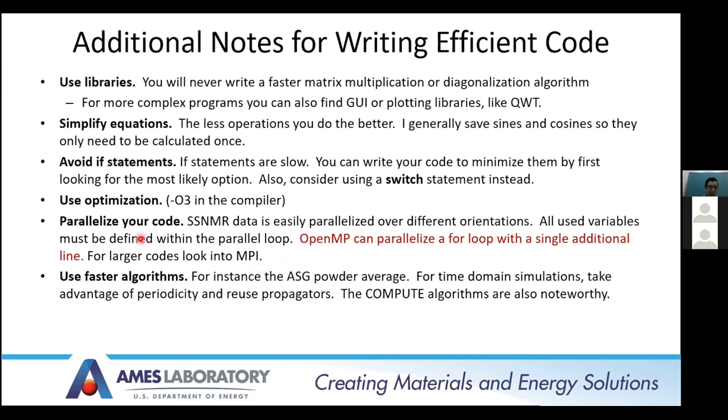And lastly, like someone mentioned, you'll want to use the faster algorithms. So if you're doing calculations in the frequency domain, use the interpolation scheme of Alderman, Solum, and Grant. And if you're doing time domain calculations, you can take advantage of periodicity and reuse propagators, or you can look at things like the COMPUTE or gamma COMPUTE algorithms.